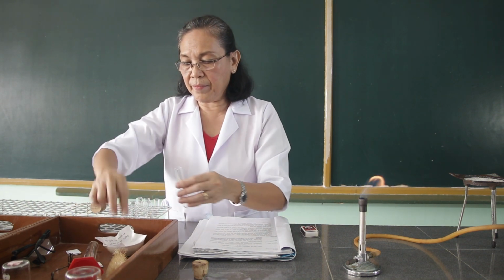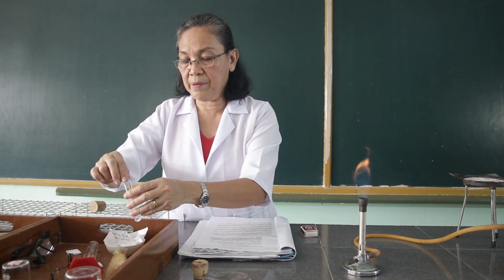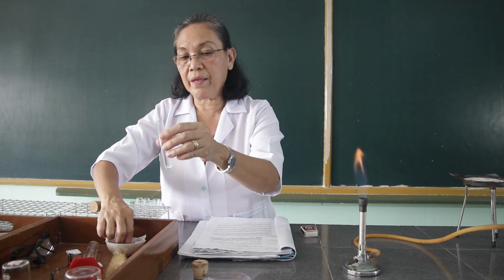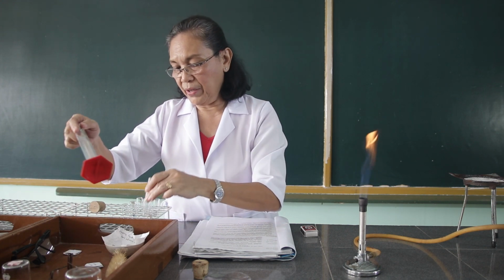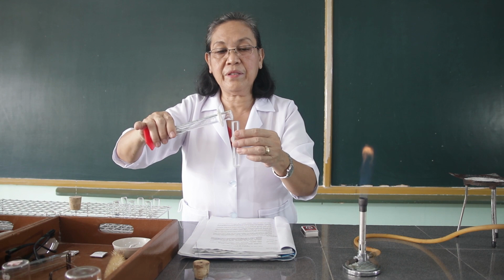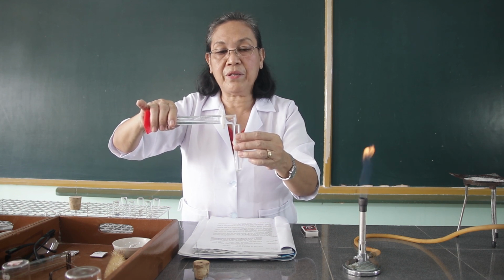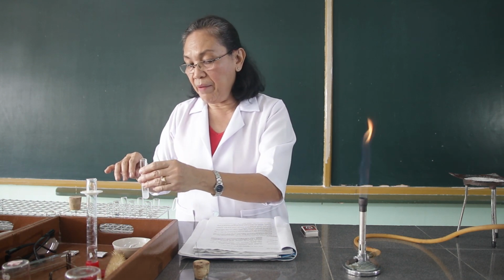So let's take a pinch of the sodium carbonate, and then add 1 ml of distilled water, and 1 ml of the hydrochloric acid.